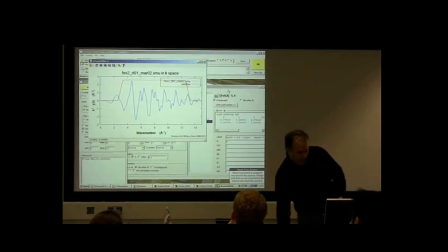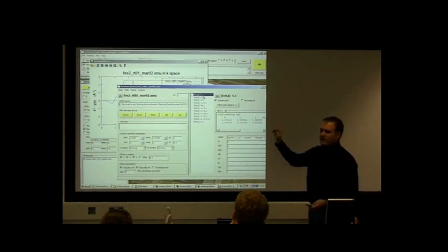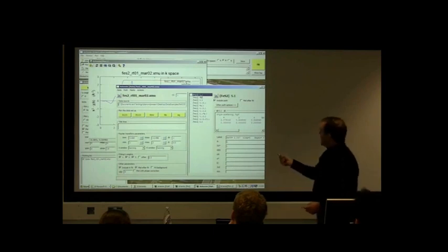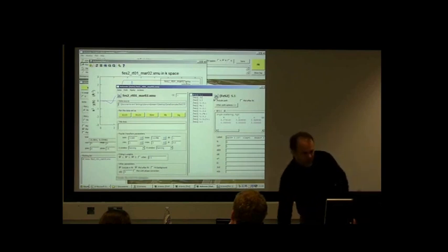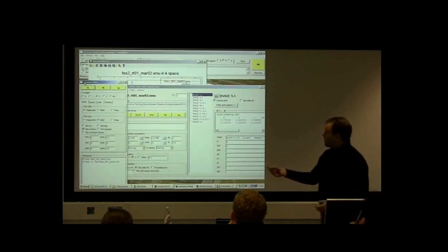So what I want to do now is start examining how these different paths relate to the data. To get started, I'm going to select the first path in the list, S1, and then click on this little button right here, which transfers this path over into the plot list. Now, when I click one of these buttons up here, everything in the plot list will get plotted.